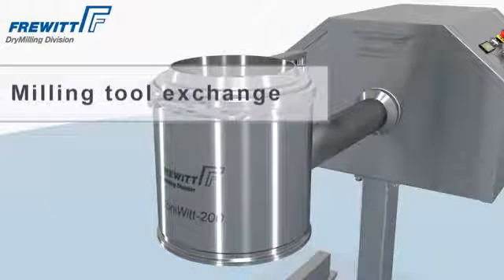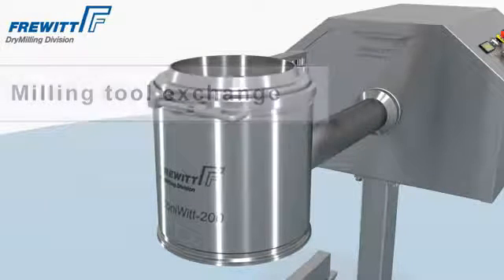Due to the intelligent design of the Konivit Mills, the rotor and sieve can be disassembled within minutes.